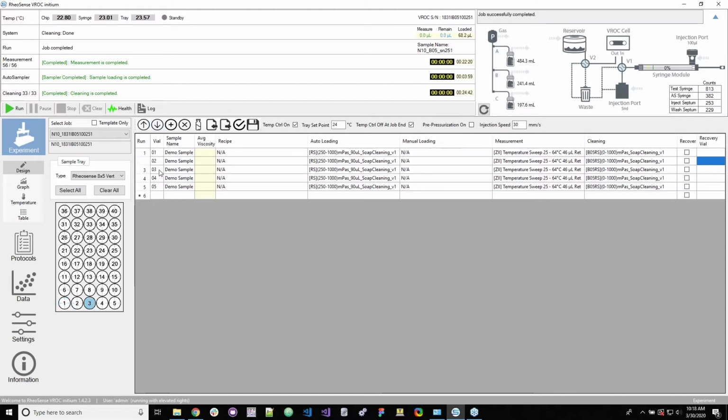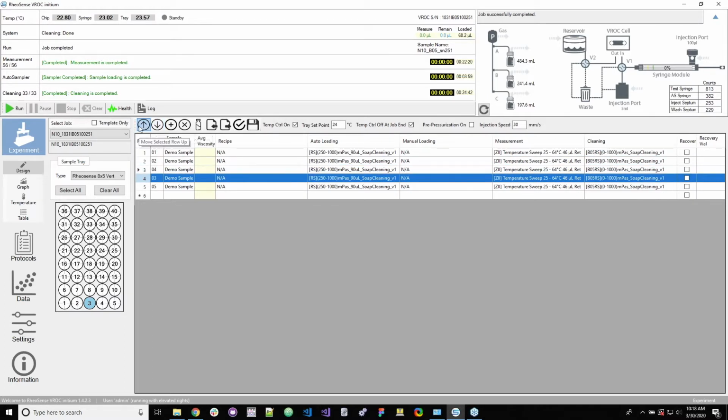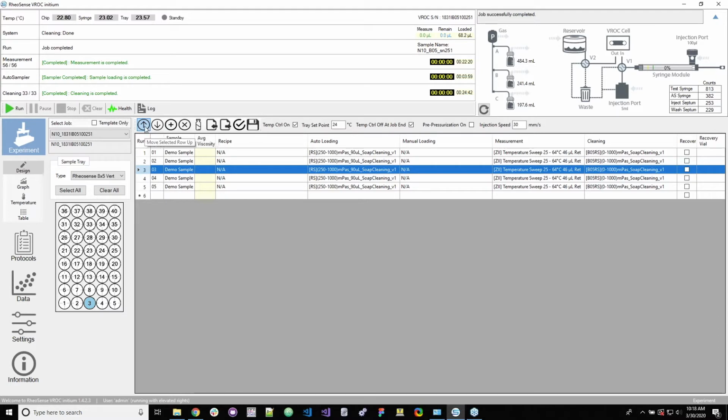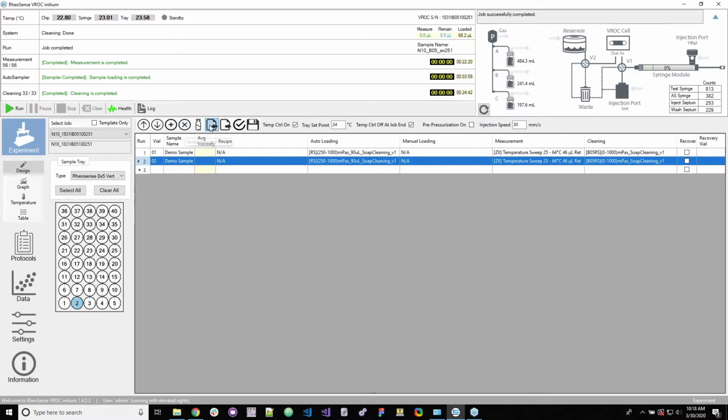And then we can also move these around if we so choose with this move selected row feature. And then we can add a new run. We can also delete the selected rows. And then we can also import and export sample names. And then you have a validation tab and save a template. So we can save this as a template if we so choose.